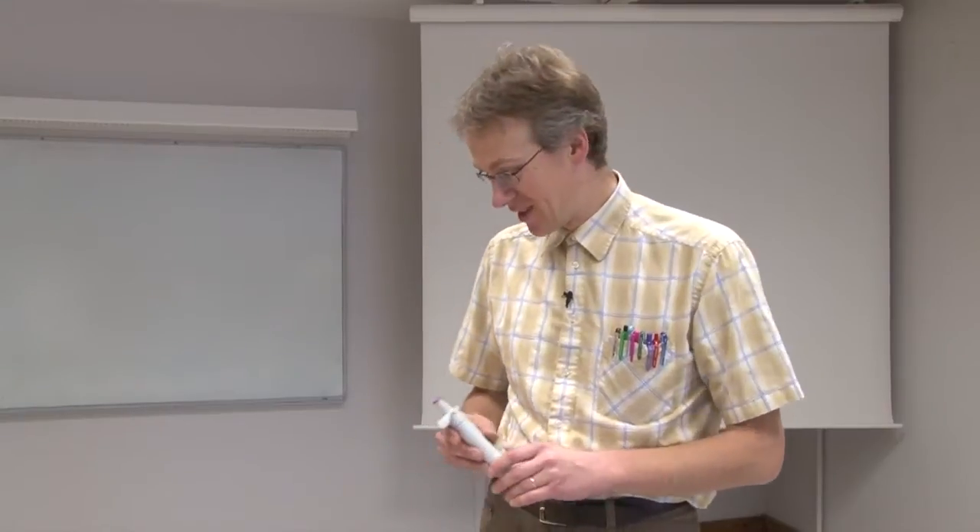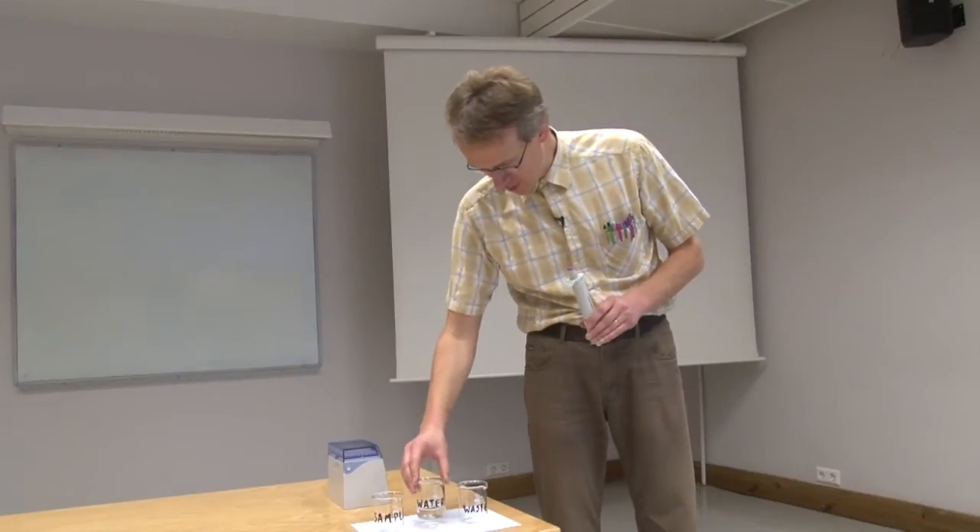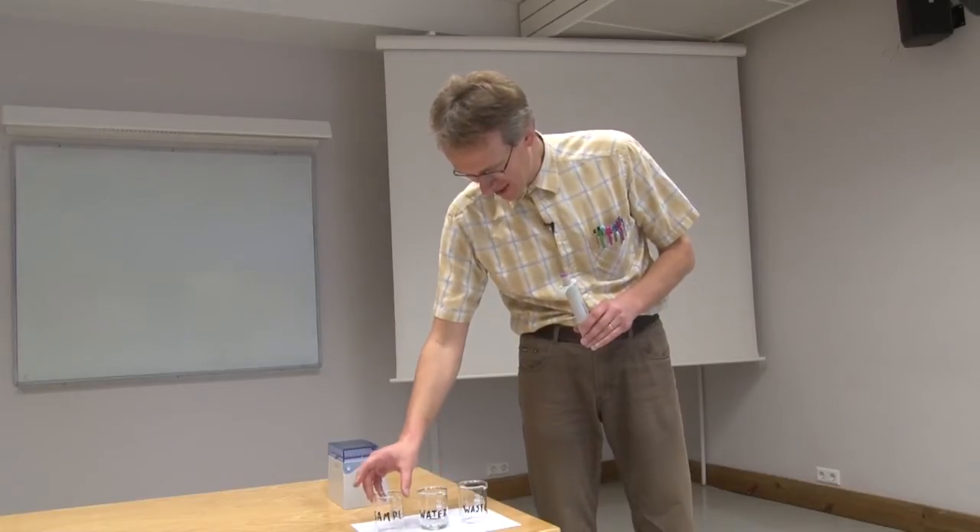Let us see where measurement uncertainty comes from when doing pipetting with an automatic pipette. I'm holding an automatic pipette and with this pipette I'm going to pipette exactly 2.3 milliliters of water from this water beaker into this sample beaker.